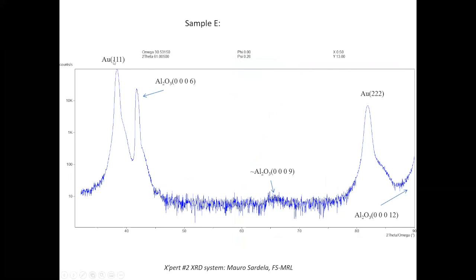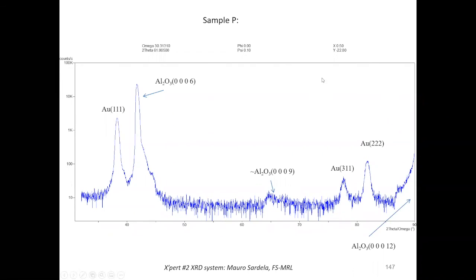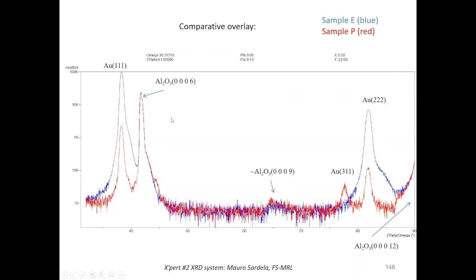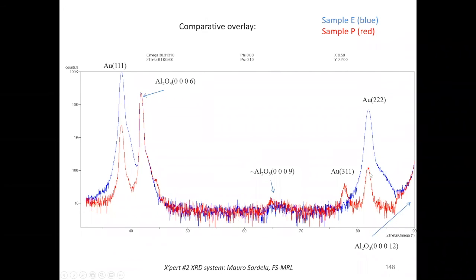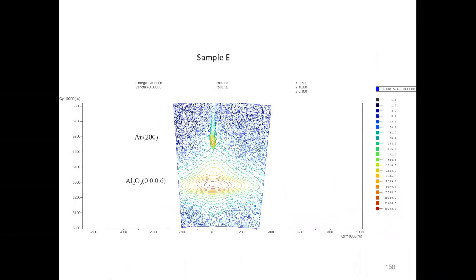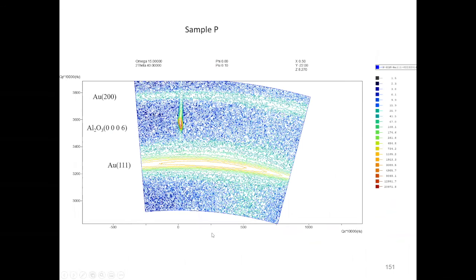And in this case, you can see we did a reciprocal space map of the epitaxial one. When the user initially just put the sample in and did this scan, this is the one for the polycrystalline. When the user put in the epitaxial sample and did the scan, this is what he got, and it was easier for him to get the data because it was across the actual main peaks. But when he put in the polycrystalline sample, he was scanning off the film peak by a fraction of a degree. Then, as we aligned and maximized and did the scan, he was in the right location.